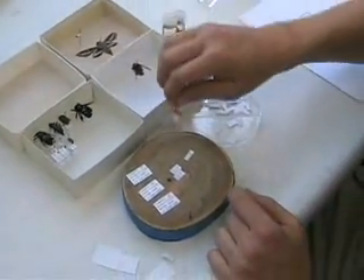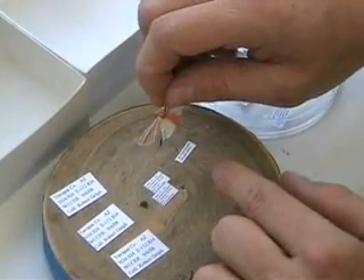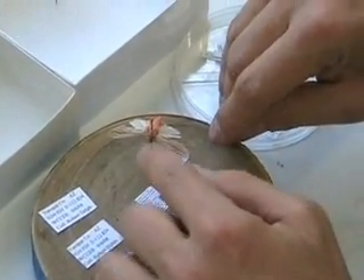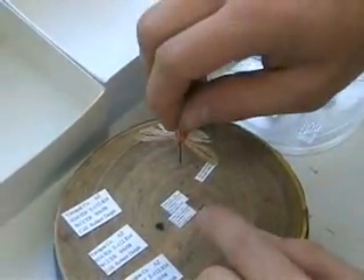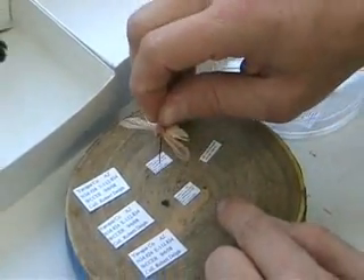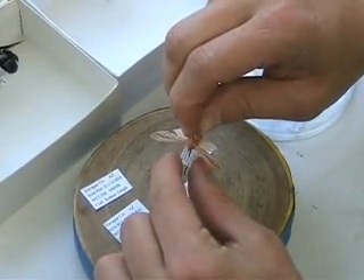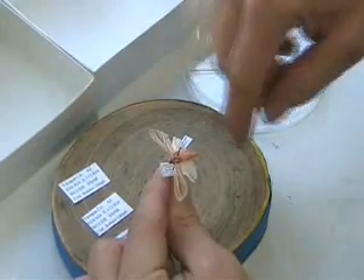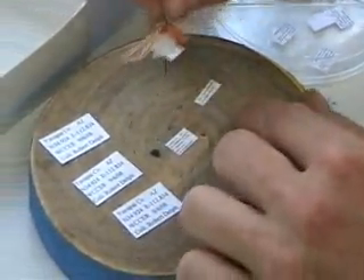Moths and butterflies — you put the label on them the same way you would with a pinned insect. With pinned insects, the label reads from left to right, head to abdomen. Butterflies and moths may look like there's space at the front, but it's still better than having the label going left to right across the thorax.